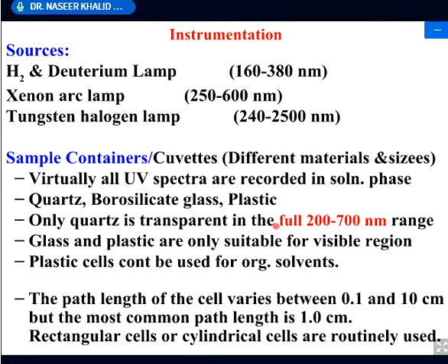So we should use materials which do not interact with the electromagnetic radiation we are using.